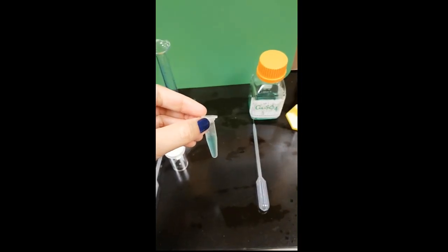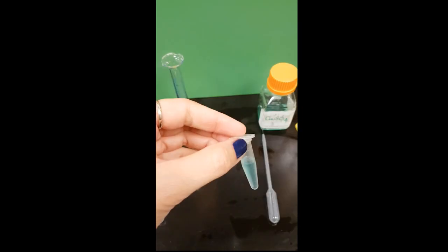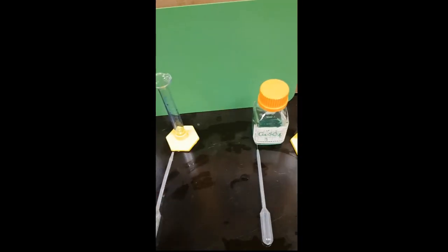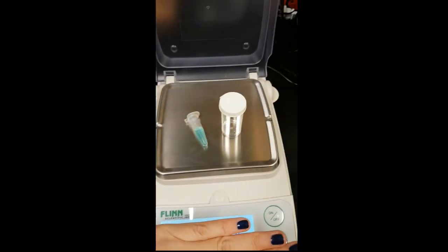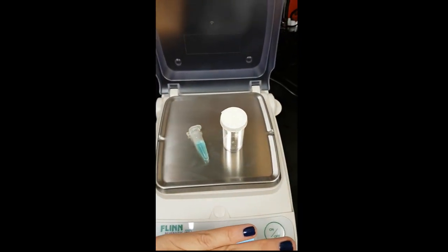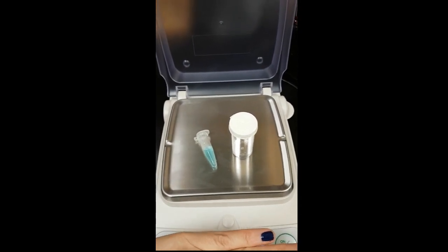After the transfer, you close the cap, place it on the balance, then transfer the sodium hydroxide into the vial. After transferring both chemicals, you place them on the balance and register your reading.